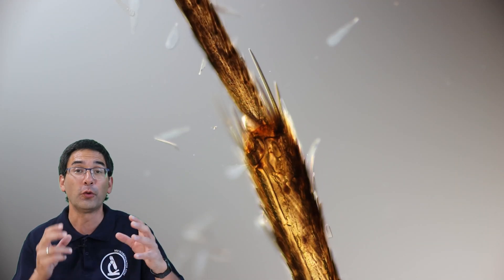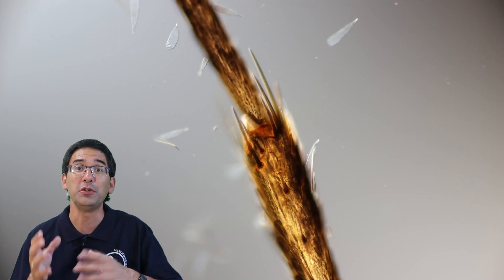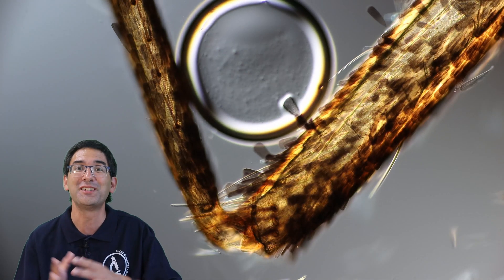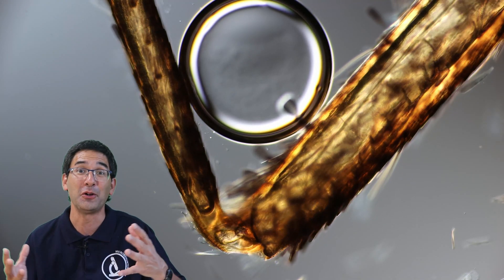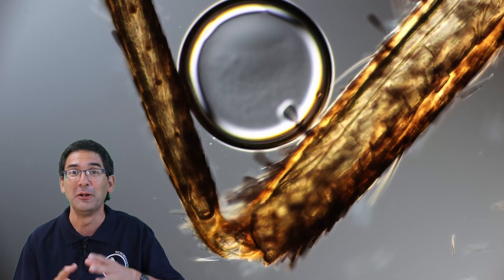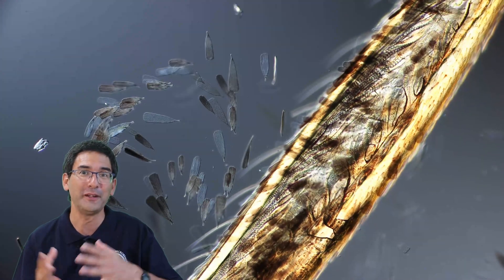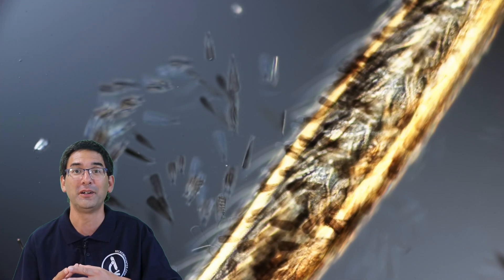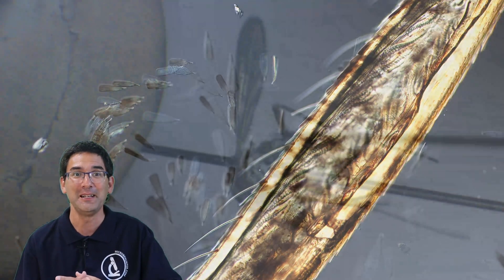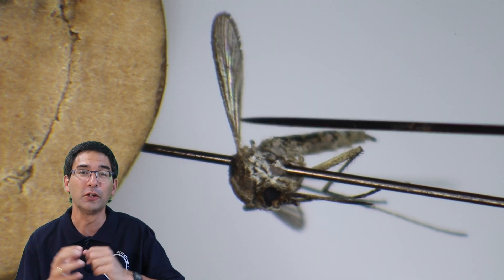It's fascinating to see how long the legs are. Being arthropods, the legs are jointed, and the muscles that move them are found inside the leg. This round structure here is an air bubble — because as I'll show later, I did make a permanent mount of this mosquito, but I was not able to exclude all of the air bubbles. Here again are some broken-off scales, and the leg of the mosquito. As a matter of fact, I mounted four of the six legs on a microscope slide.